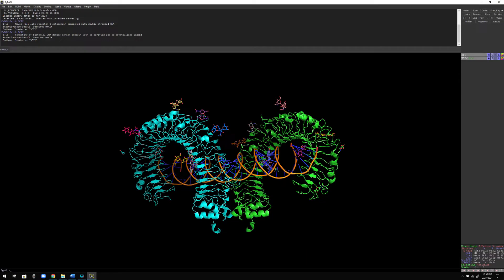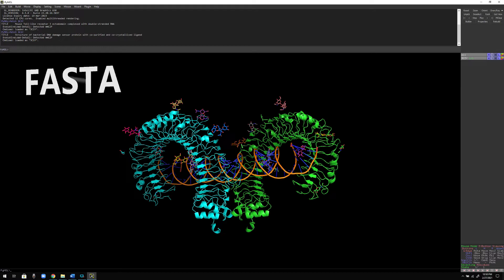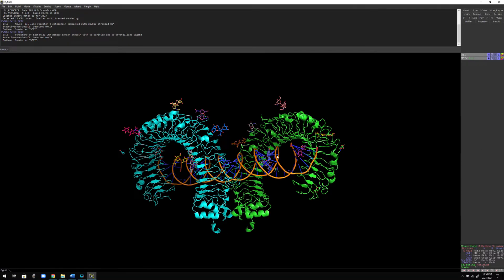Hi everyone, welcome to Basic Science Series. I'm your host Lukindul Kumar, and today I'm going to show you how you can extract the FASTA sequence of any protein molecule using PyMOL. I'm sure that you know how to extract the FASTA sequence using UniProt — you can also extract FASTA sequences using Protein Data Bank. I'm going to show you both ways.